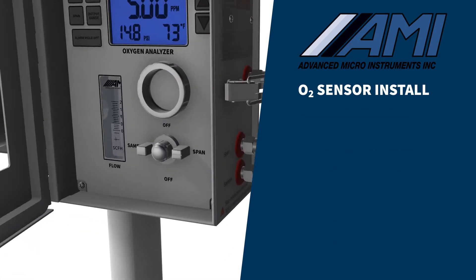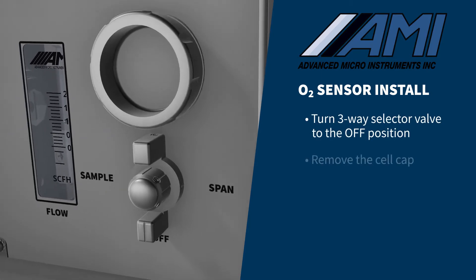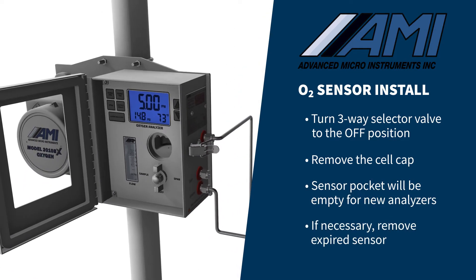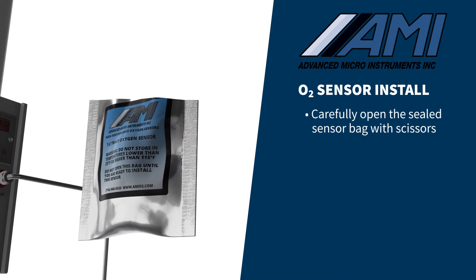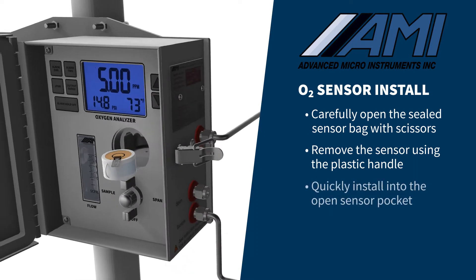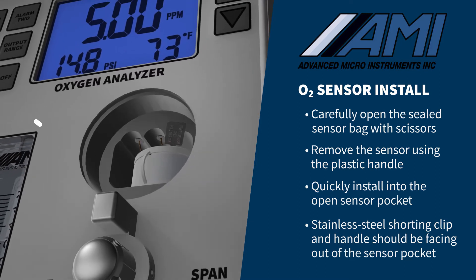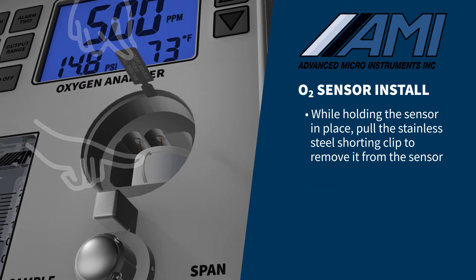To start the sensor replacement process, turn the 3-way selector valve to the OFF position. Remove the cell cap. The sensor pocket will be empty for new analyzers, or remove the expired sensor for replacement. Carefully open the sealed sensor bag with a pair of scissors. Remove the sensor using the plastic handle and quickly install it into the open sensor pocket. The stainless steel shorting clip and handle should be facing out of the sensor pocket. While holding the sensor in place, pull the stainless steel shorting clip to remove it from the sensor.